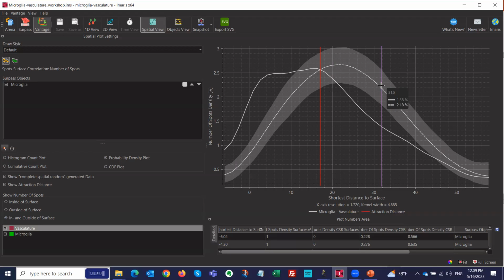And then this is where you can just ask yourself more questions like what's the underlying reason behind this, how can I implement my next experiment and so on. Okay.